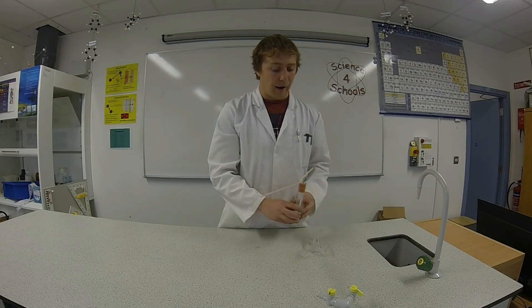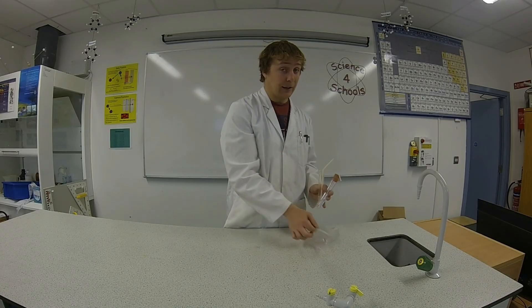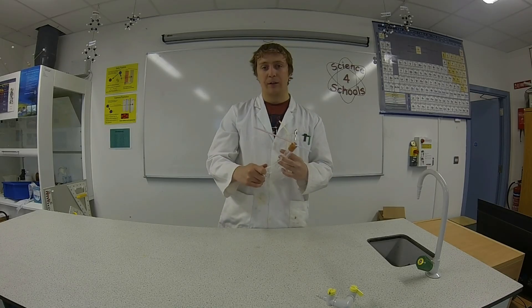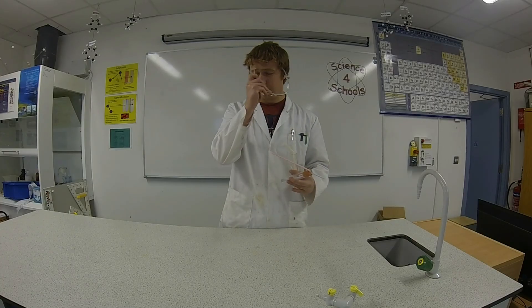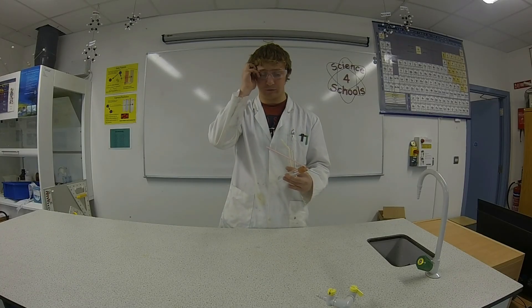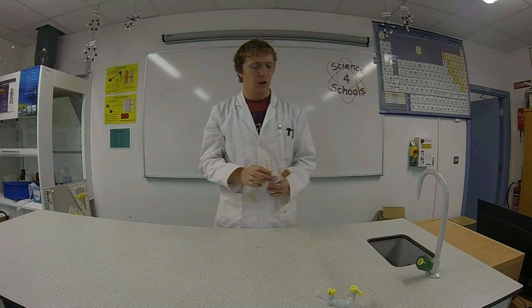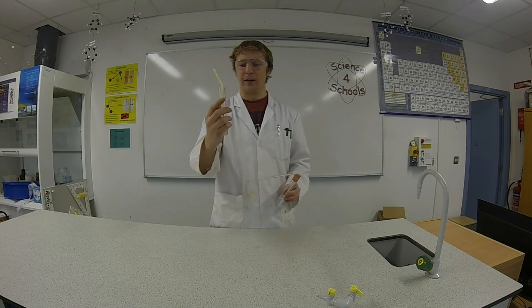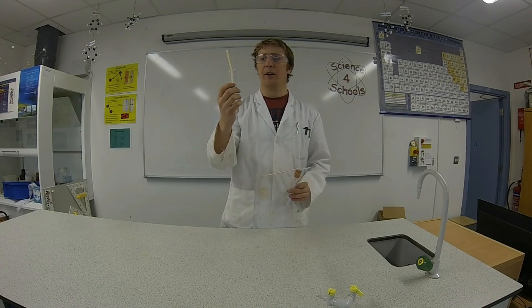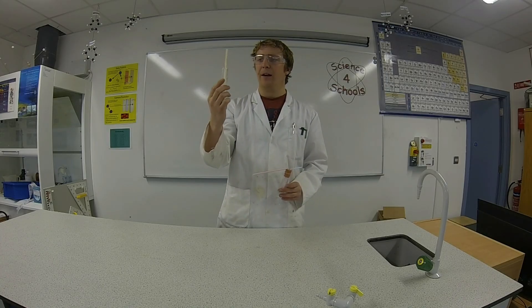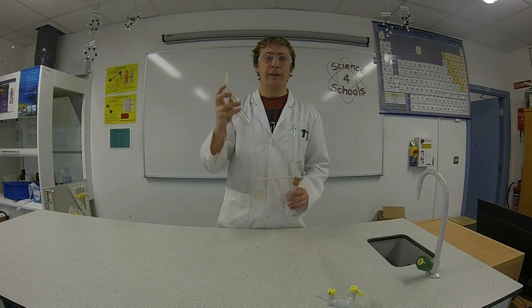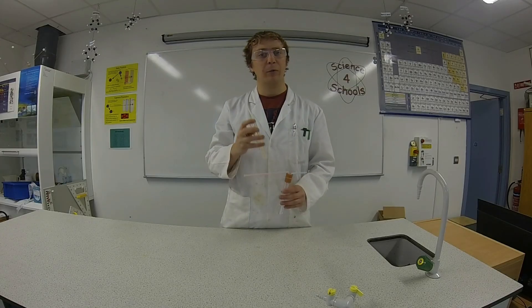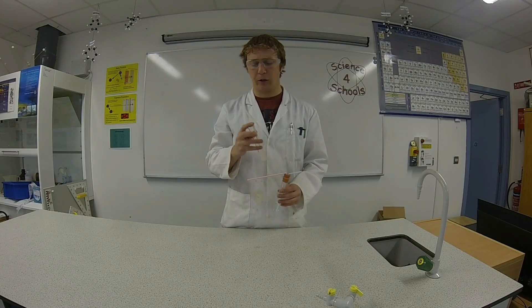First of all, you need goggles on because you need your eyes to see the results. In the first test tube I'm going to exhale into the straw and the straw into the lime water, and we'll see the lime water turn milky.